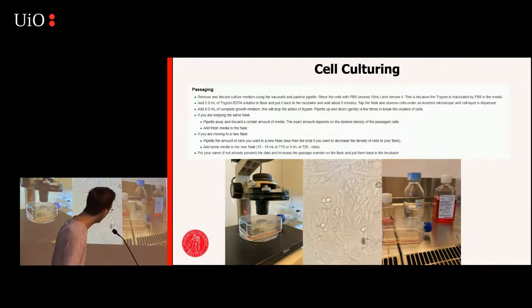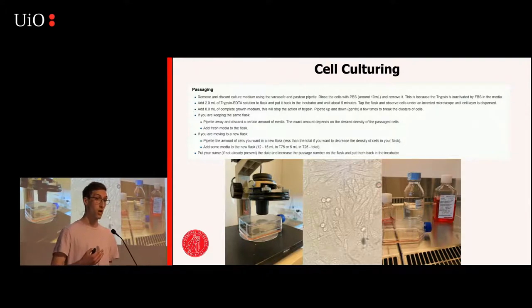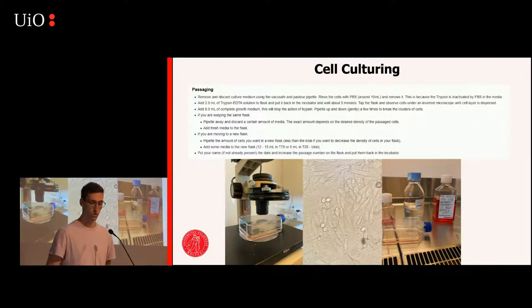And I quite like this image here because you can actually tell when the cells are happy and when they're unhappy, as we like to say, right? Cells don't have emotions. They can't be happy. But when they are happy, what they do is they start sticking to the walls, and that means they're stretching. So these really stretchy boys over here, these guys here, they're super happy. These round ones here, they've kept their spherical structure, so they're likely unhappy, probably due to overcrowdedness.